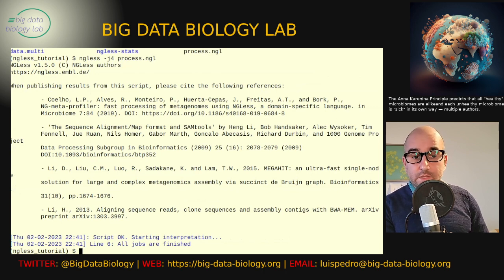So that's it. That's how we've used this to process, as I said, tens of thousands of samples. It scales really well. You can use it on a compute cluster.